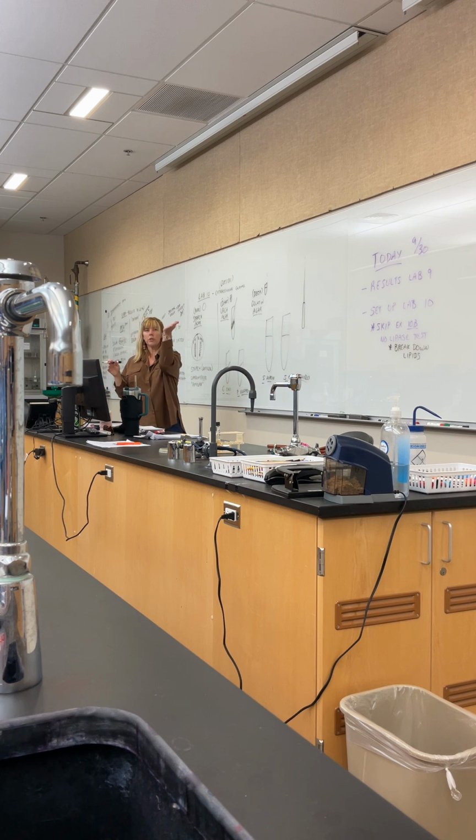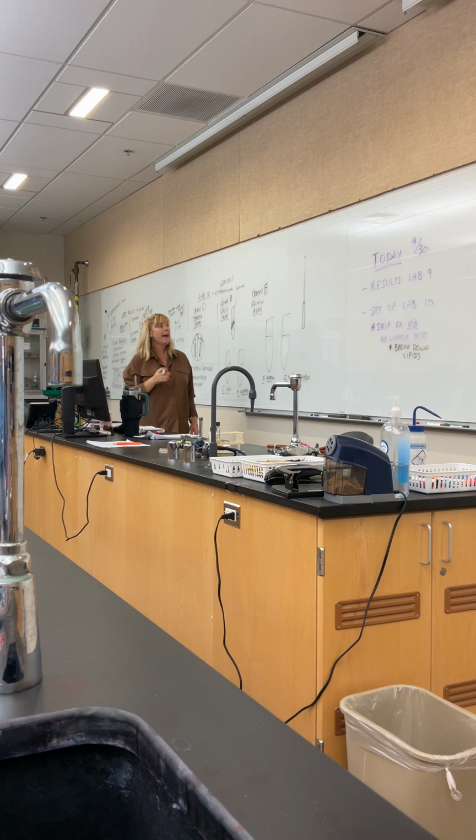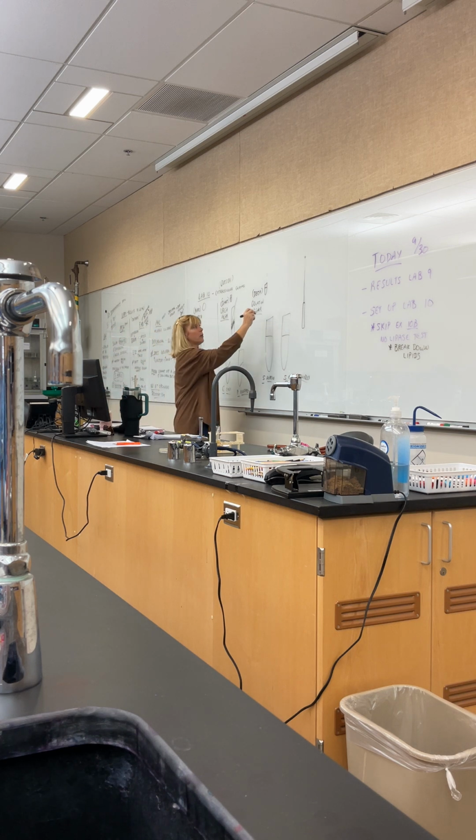When it's cooled, you take your plate and you take the needle and you roll it in the bacteria, so you pick up a lot of bacteria on the tip. All I'm doing is holding that needle and rolling it on top of the surface of the plates or the tubes, whatever you have in front of you, and I'll pick up a little bit of gunk on the surface of that needle. And then what I'm gonna do, this is so satisfying, is you get to stab the heck out of the gelatin. You get your needle and you're gonna go straight in and straight out.